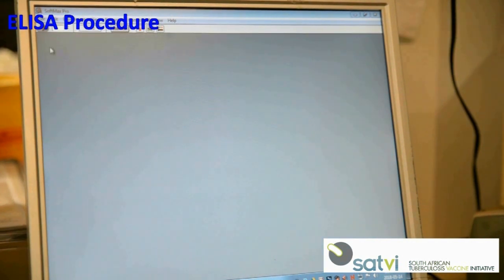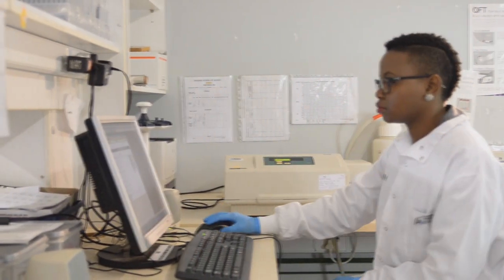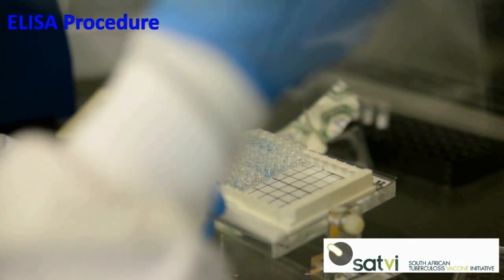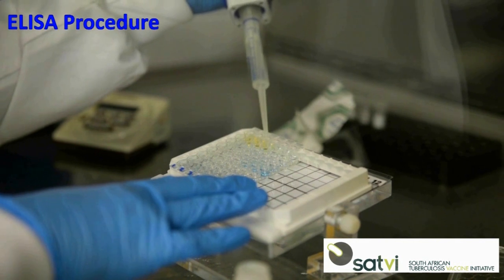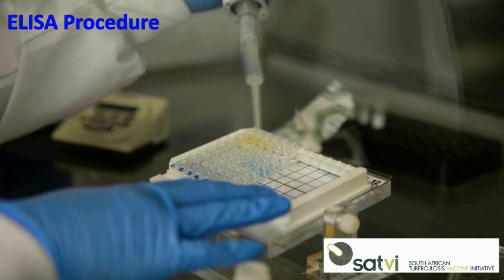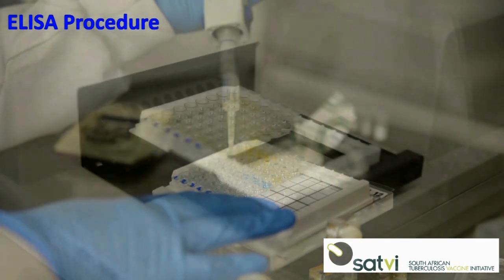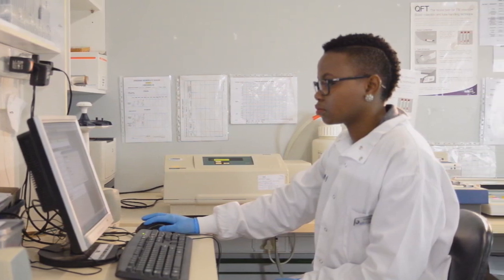Select the following settings on the spectrophotometer: the number of strips to read, wavelengths 450 nm and 650 nm, and select to have the subtracted values displayed. Add 50 microliters of the stop solution to each well and mix briefly on the plate shaker. Remove the plate lid, place the plate into the spectrophotometer, and read the ODs. Copy the plate ODs into a new Excel document and save.